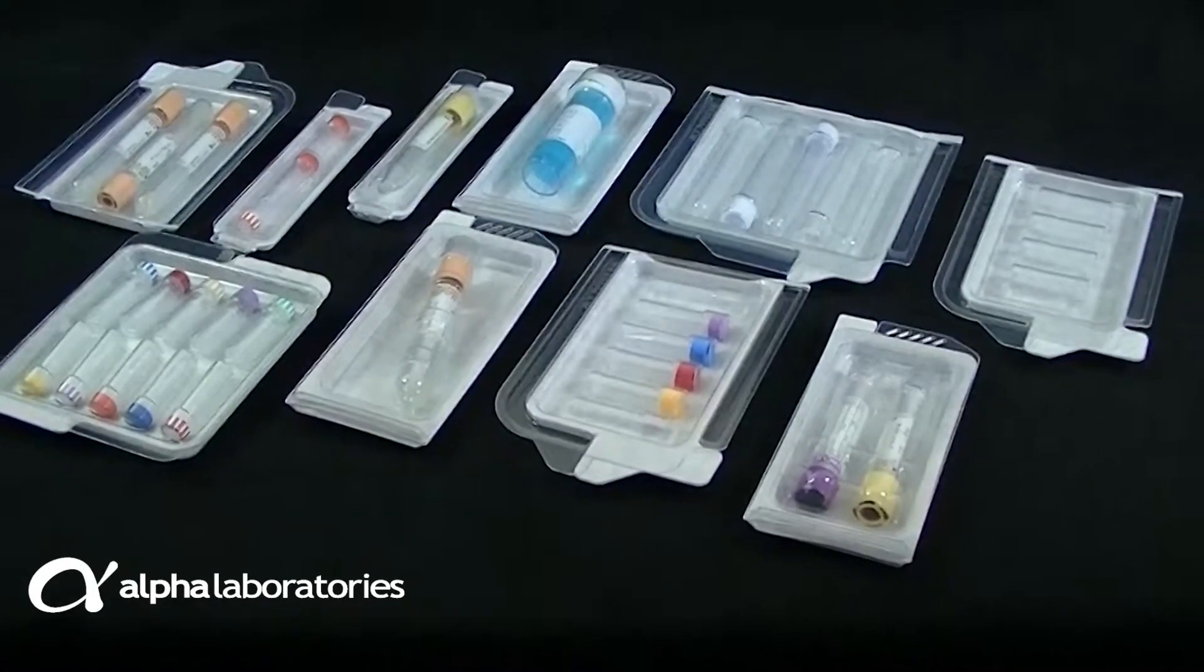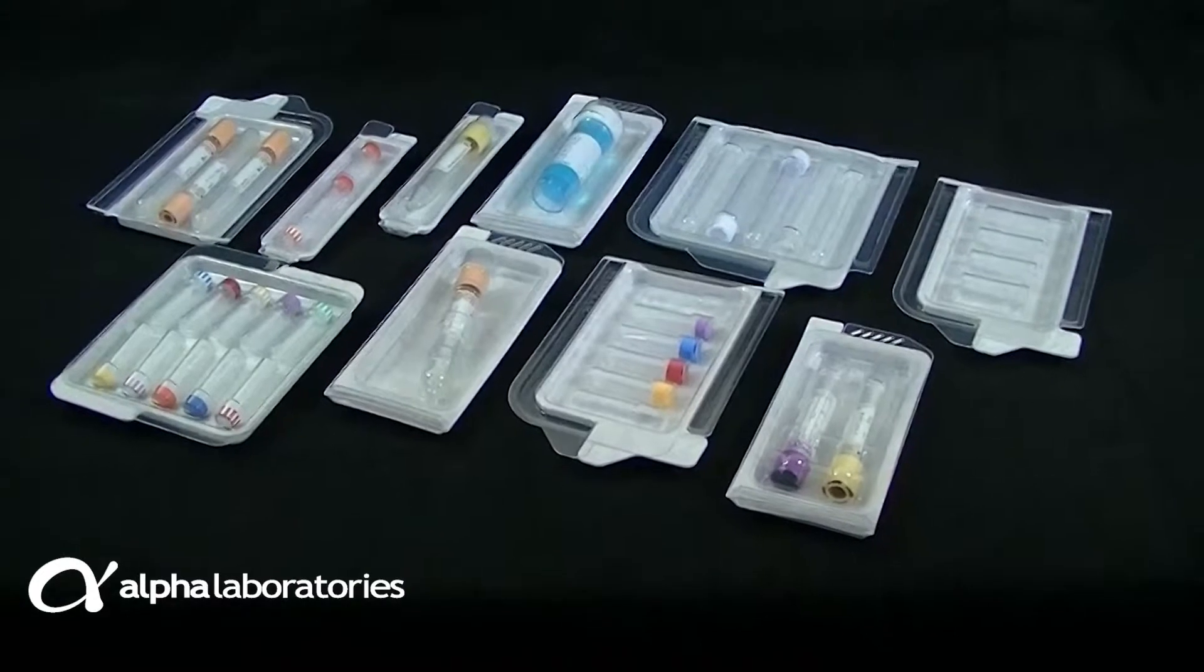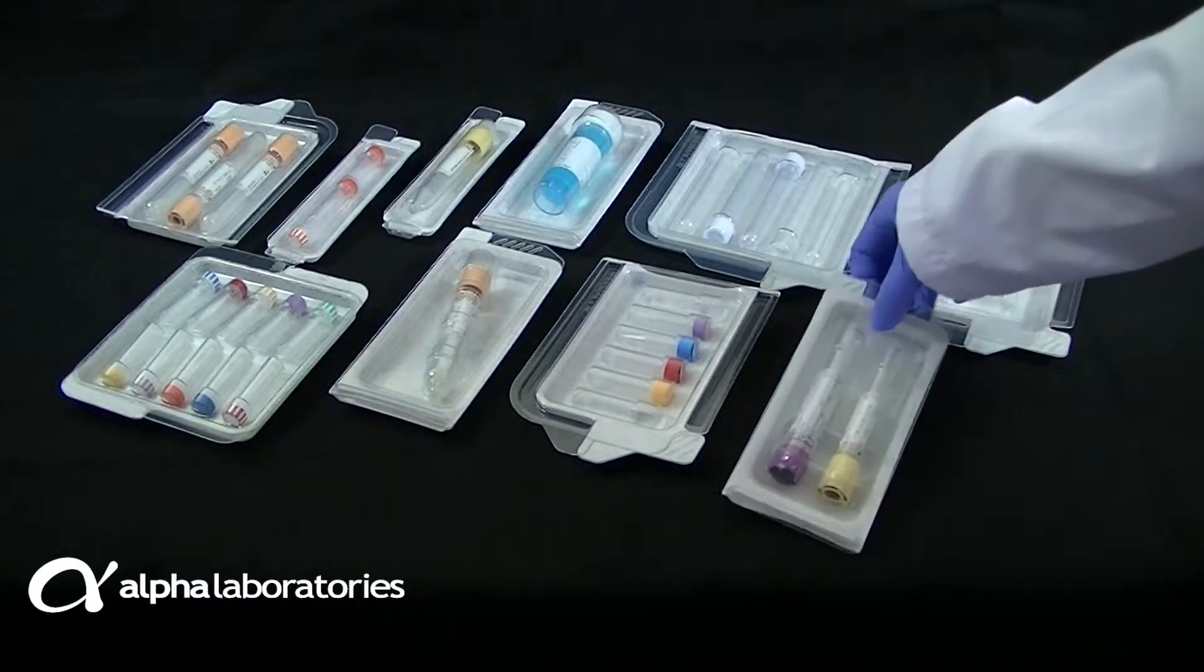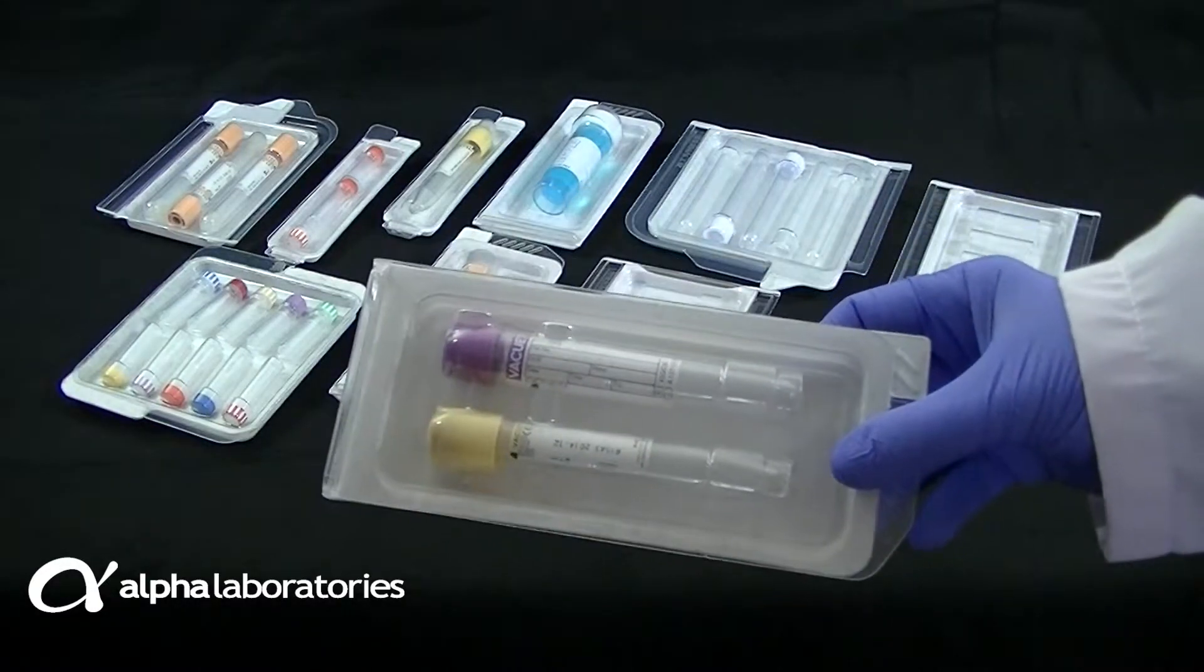The convenient, ready-to-use, single-piece, flat construction is compliant with UN3373 regulations when used with 95 kPa primary containers.